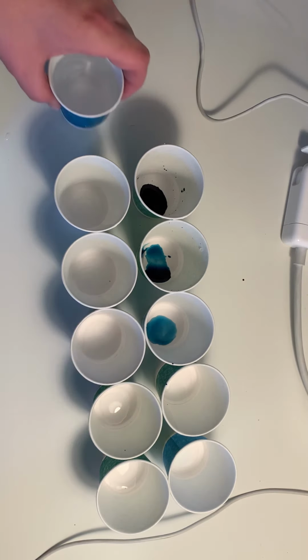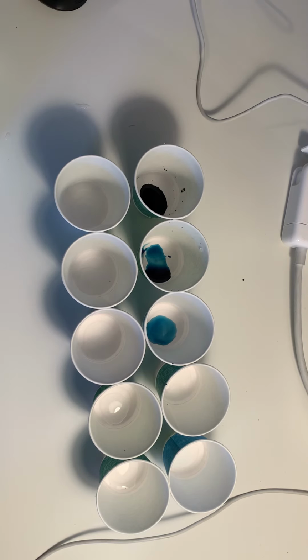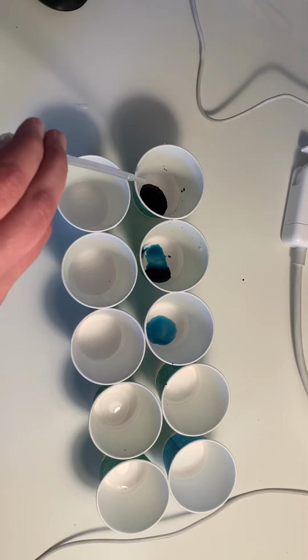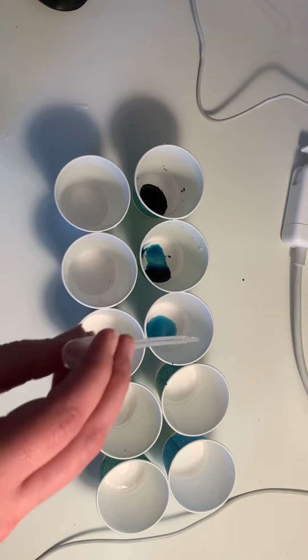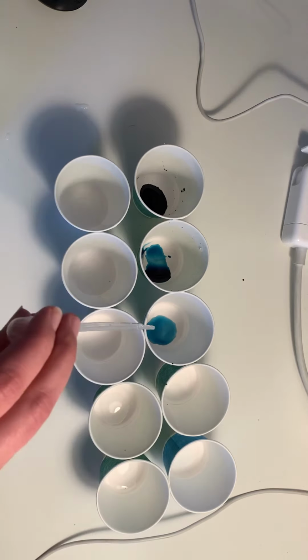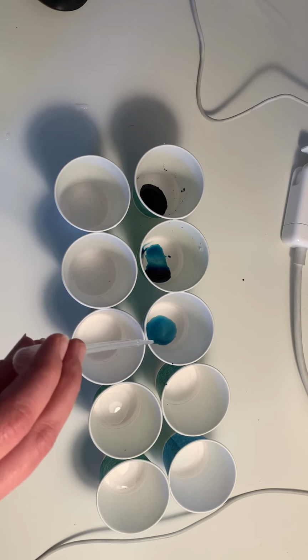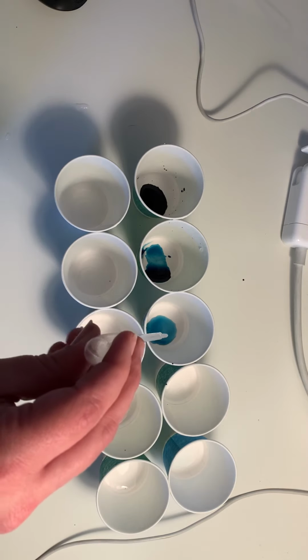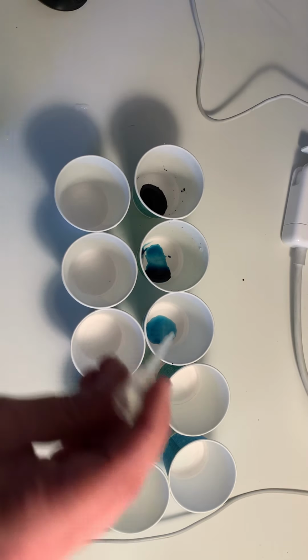What that will mean is I don't have to use my water anymore. Now I'm going to take from this cell, which is cell 3. I took 1 drop from here, put it in there, 1 drop from there, put it in there. And each time I add 9 drops of water. So this one is now 10,000 parts per million. We can definitely still see the color, but it's definitely less than it was.